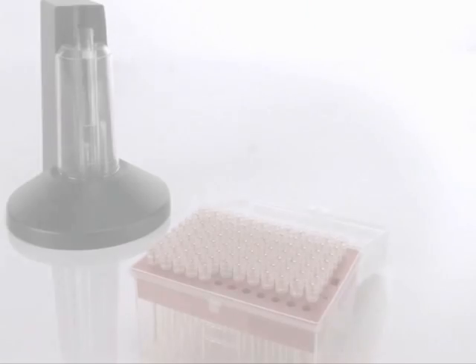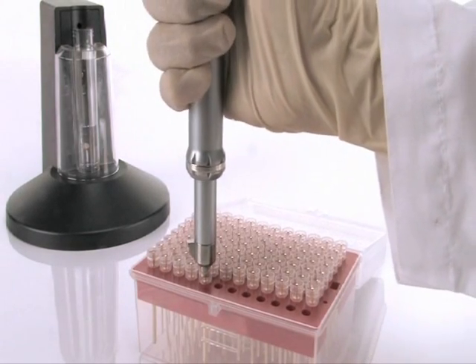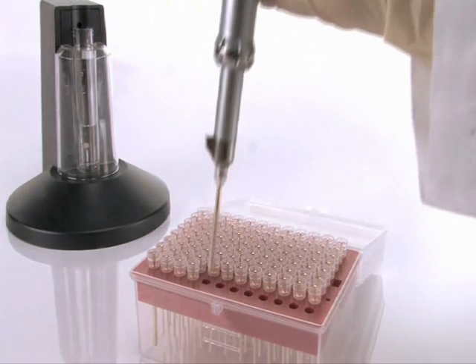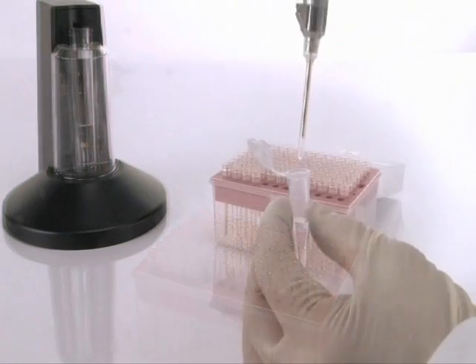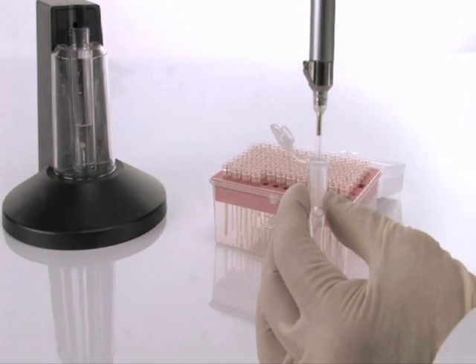How does it work? Similar to using a traditional pipette, you first acquire a NEON pipette tip which itself also serves as the transfection chamber. Load the mixture of harvested cells and nucleic acid or protein into the NEON pipette tip.